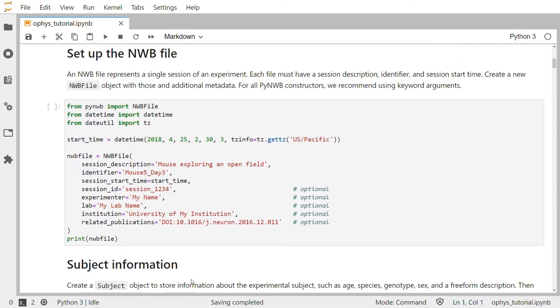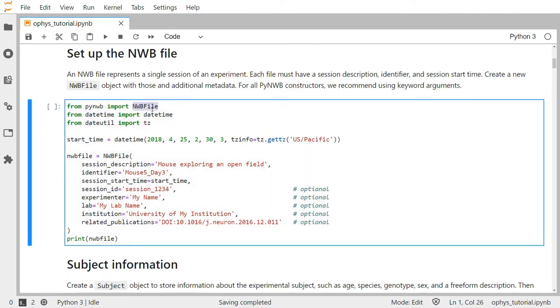Let's start setting up the NWB file. An NWB file represents a single session of an experiment. Each file must have a session description, an identifier, and a session start time. In the code below we will create a new NWB file object with those and additional metadata. Here we're importing the NWB file class from the PyNWB package, importing some datetime utilities, and then creating a new datetime variable representing April 25th, 2018 at 2:30 in your specific time zone.